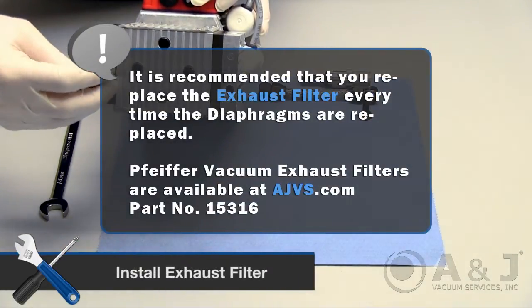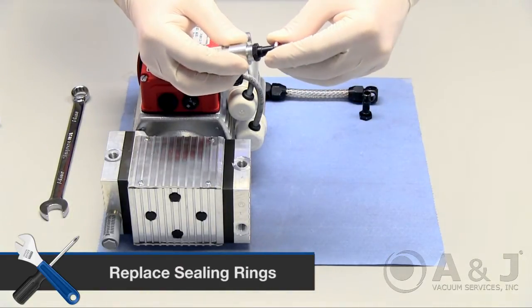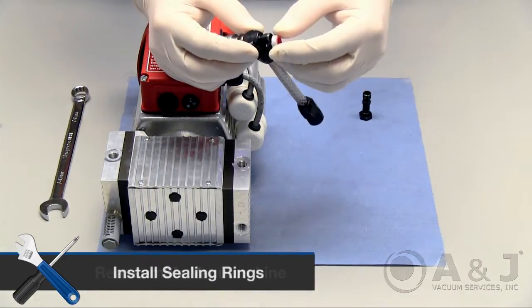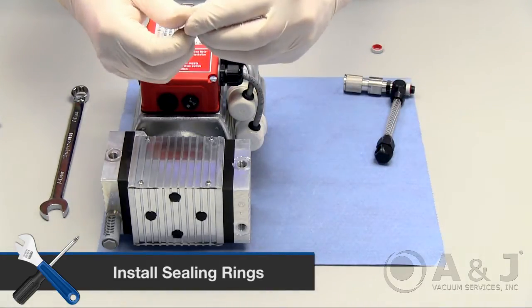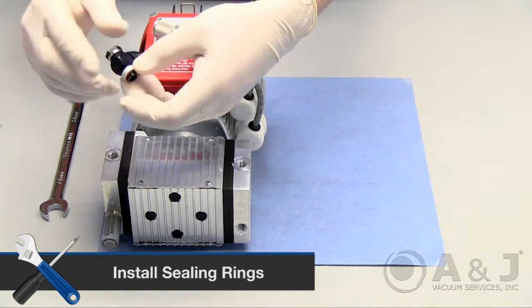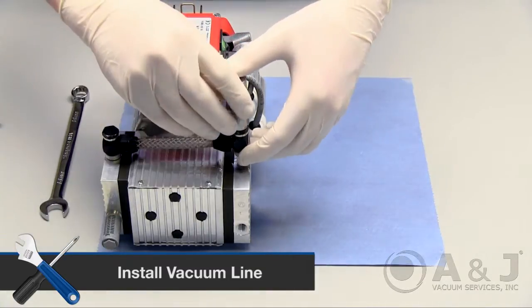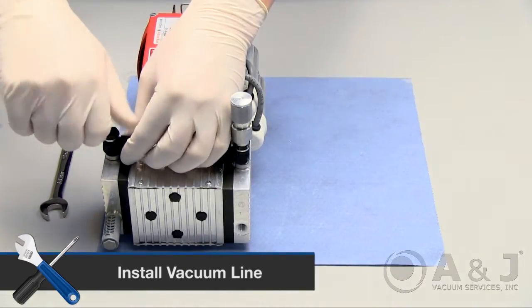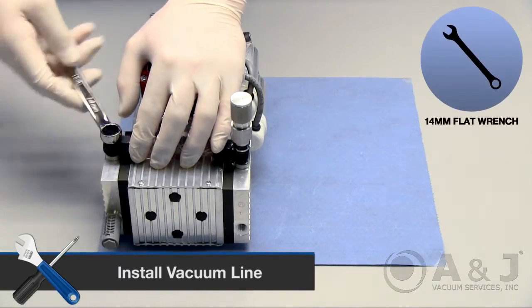Screw the exhaust back by hand and then reassemble the vacuum line. Place replacement sealing rings below the gas ballast valve and then assemble with the vacuum line. Place the wider sealing ring underneath the gas ballast side. On the end opposite of the gas ballast side, place a new sealing ring on the top and bottom. Finally, take the reassembled vacuum line and screw in by hand, then tighten the bolt with a 14mm flat wrench.